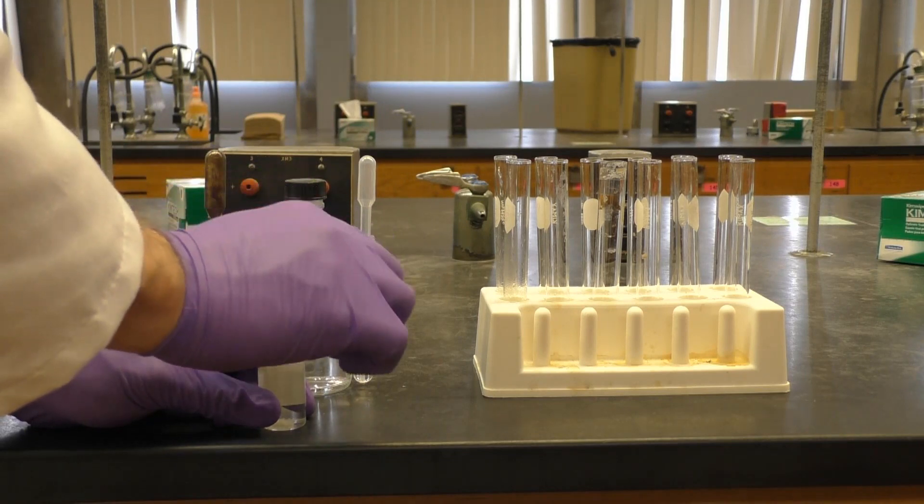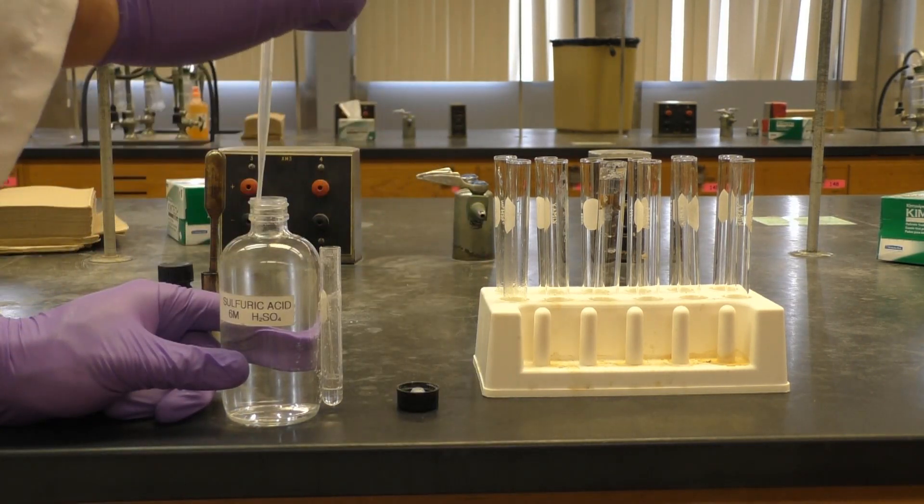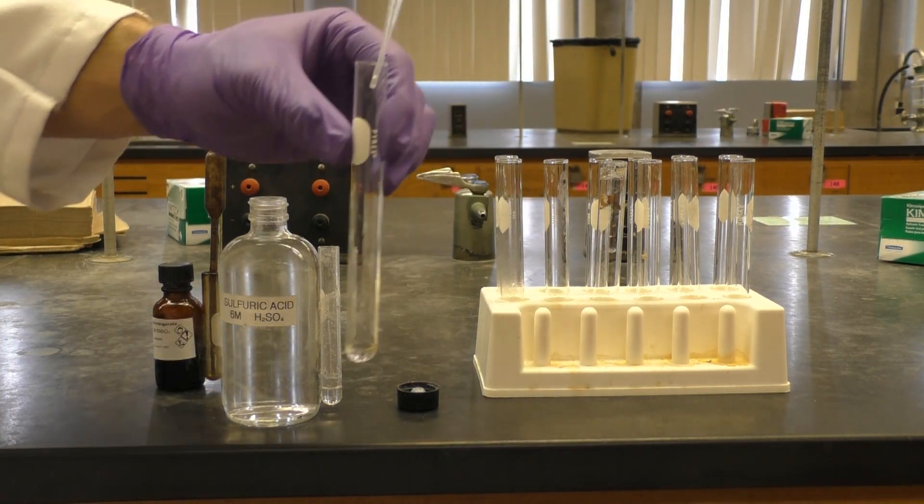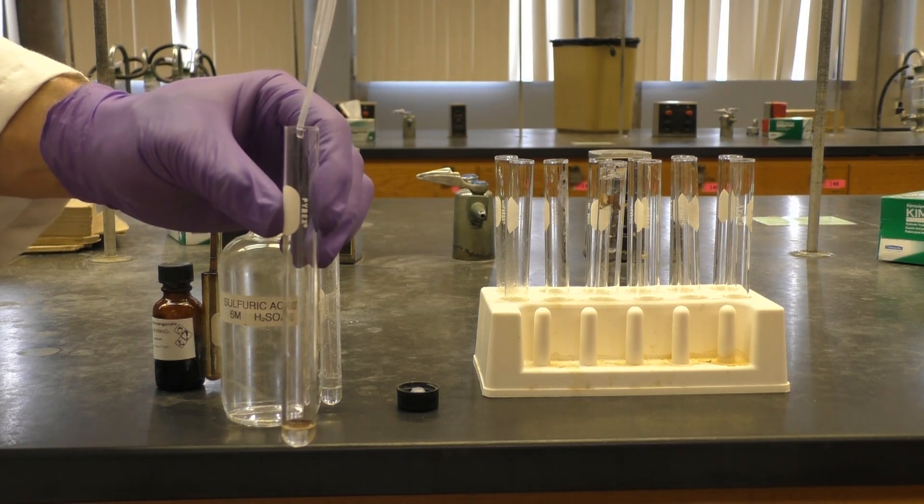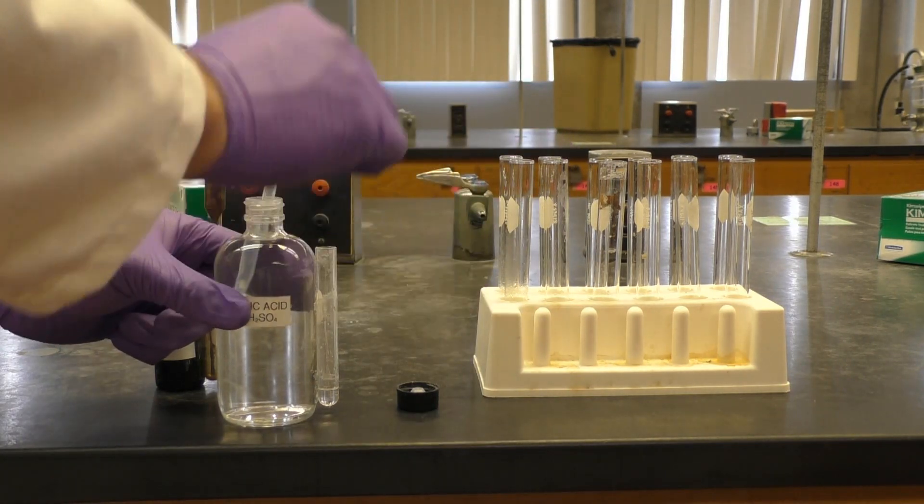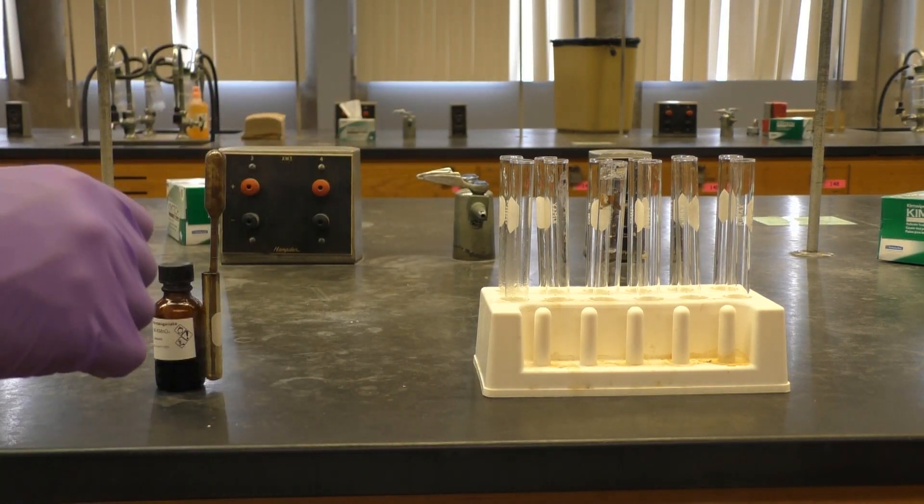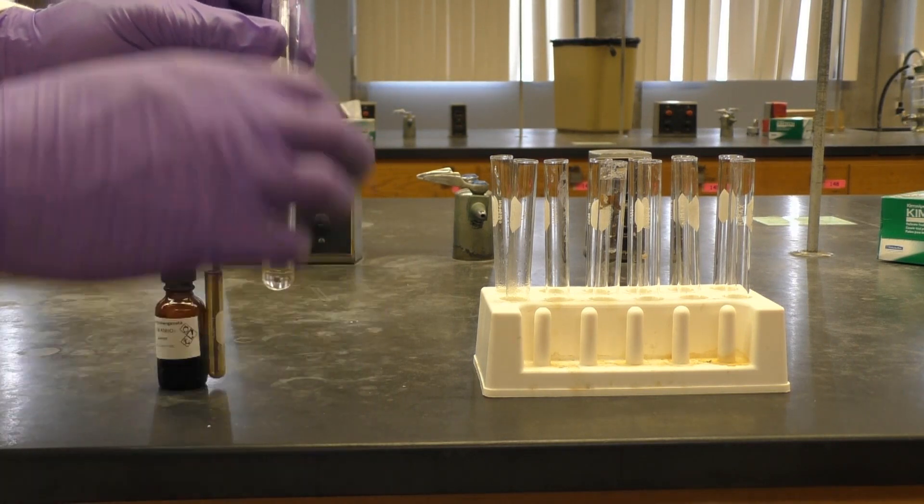Here's another redox reaction, this time with a well-known oxidant, potassium permanganate. First, we're adding one milliliter, just one pipette full, of 0.1 molar sodium oxalate. Now, we're adding 10 drops of 6 molar H2SO4. Lastly, here we add two drops of 0.1 molar potassium permanganate.